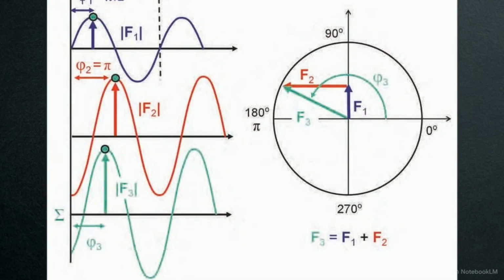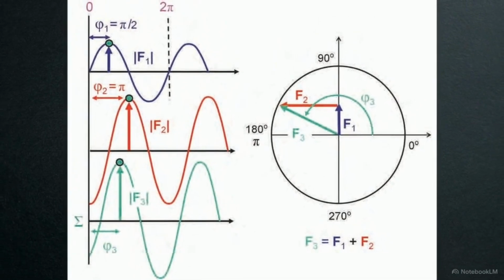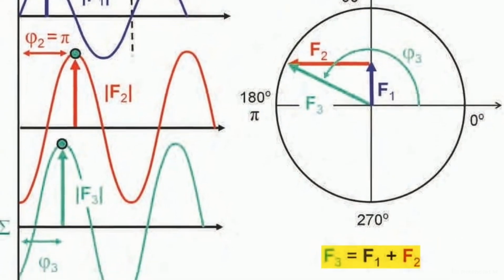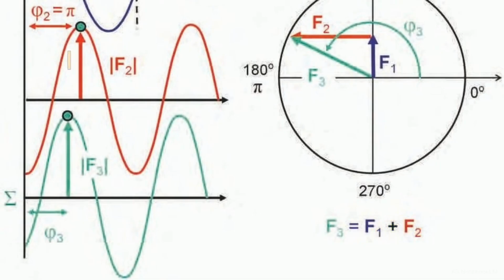This diagram shows vector addition in the complex plane, demonstrating how this translation solves the superposition problem. Calculating wave interference is no longer an exercise in plotting continuous curves. It becomes simple geometric head-to-tail addition of complex vectors. This exponential summation equation is our computational lens. It bypasses the need for physical optics, allowing us to mathematically reconstruct the combined diffracted wave.